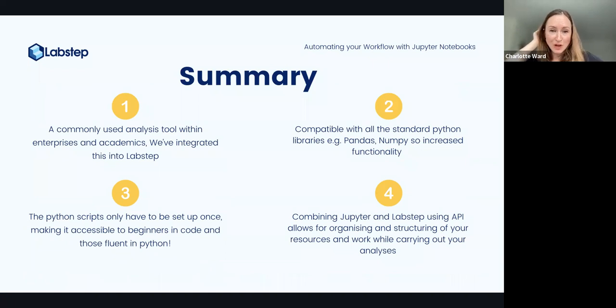But if you want to use other things, anything else on PyPI, you can install it using the pip command in your scripts. So this gives you access to a wide range of libraries.